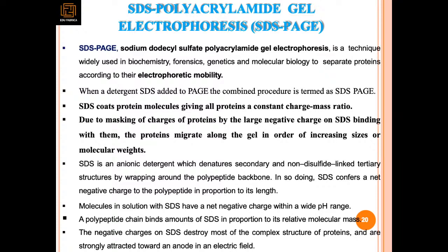Then SDS polyacrylamide gel electrophoresis, sodium dodecyl sulfate polyacrylamide gel electrophoresis. It's a technique widely used in biochemistry, forensic genetics, and molecular biology to separate proteins according to their electrophoretic mobility. When the detergent SDS is added to PAGE, the combined procedure is termed SDS-PAGE.